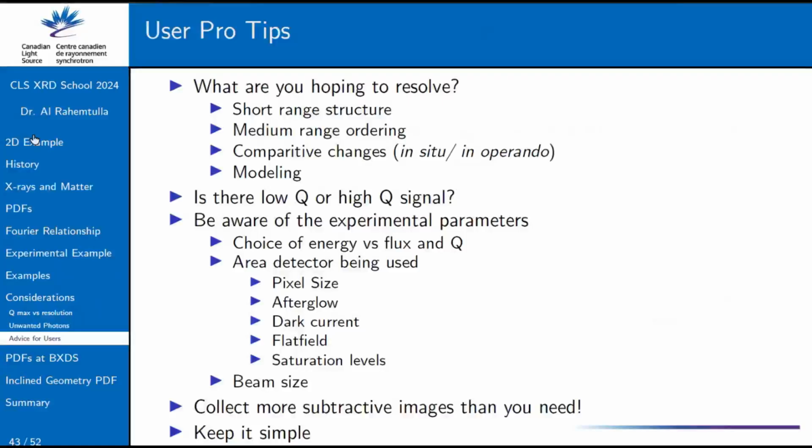Conversely, if you're interested in medium range ordering, maybe it's not worth those concessions. Or if you're doing something in situ, going very high energy might not be worth the loss in flux. So knowing that ahead of time lets us set up the best possible scenario for you guys.